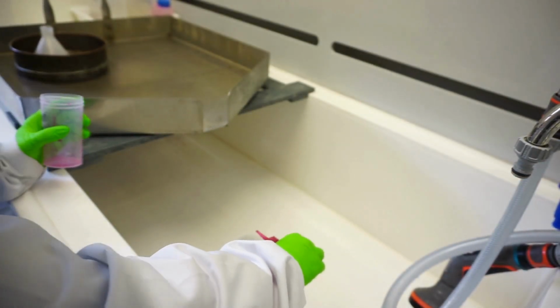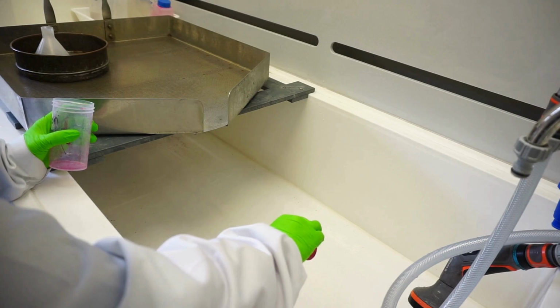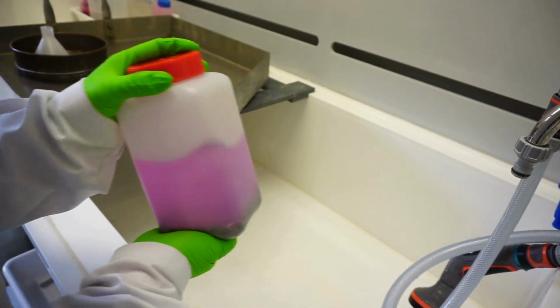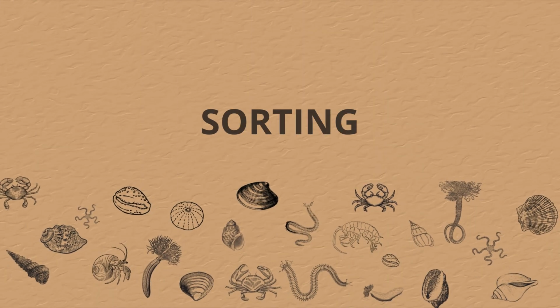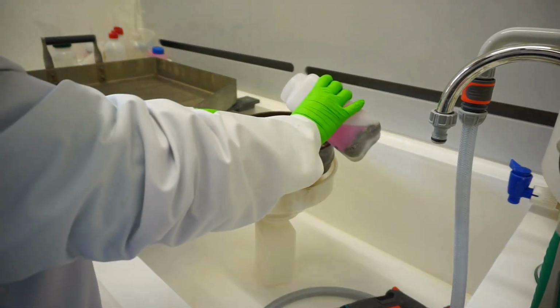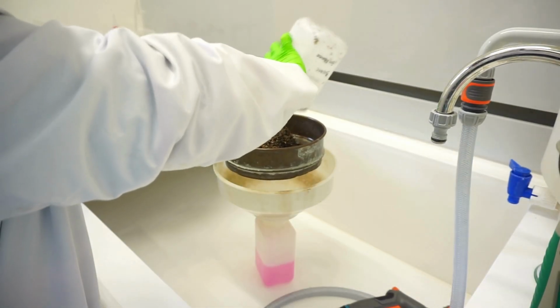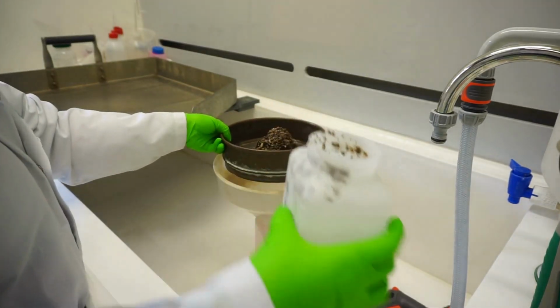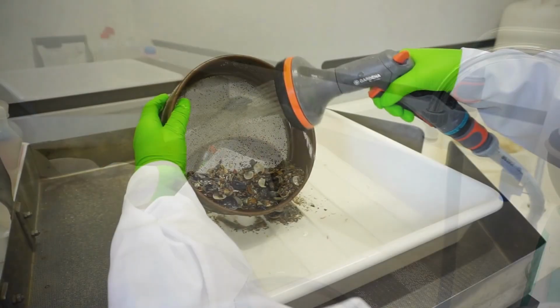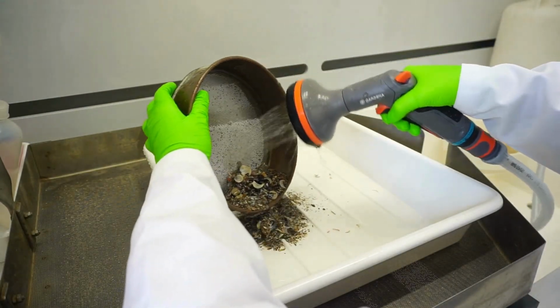A few drops of rose bengal are added to the samples to stain all organic matter present, which will facilitate the sorting process and increase accuracy. Sorting. The samples are initially poured in a 1 mm sieve positioned over a waste container to remove the formaldehyde. They are subsequently washed with tap water and placed in a sorting tray.